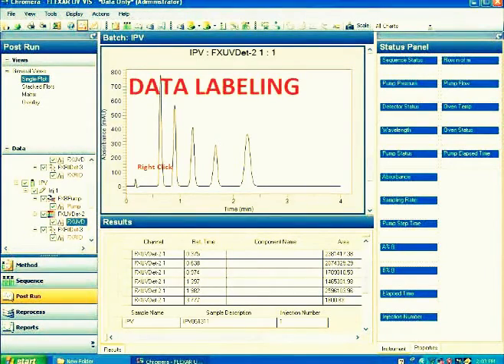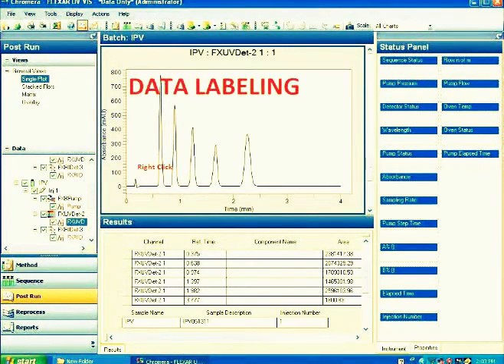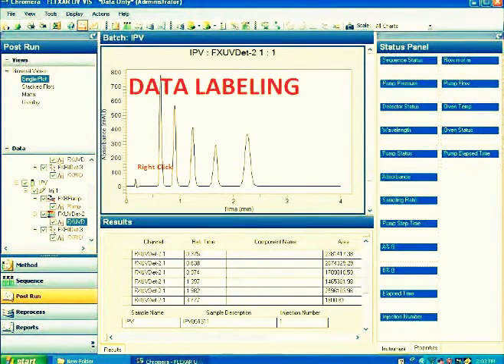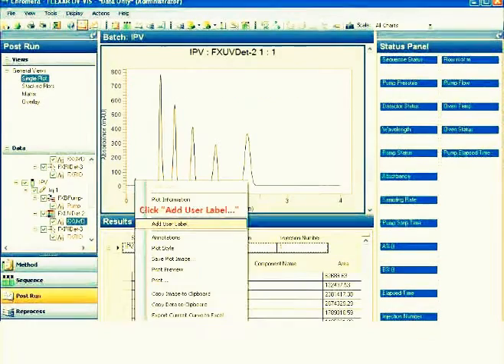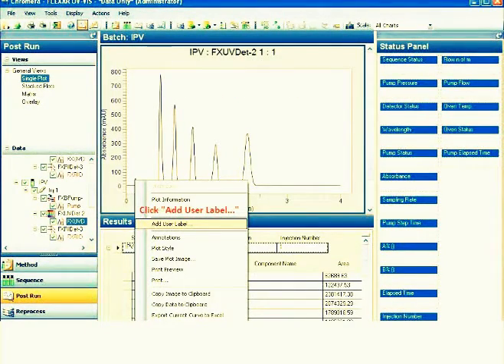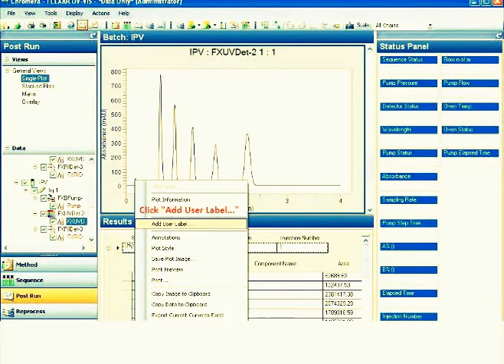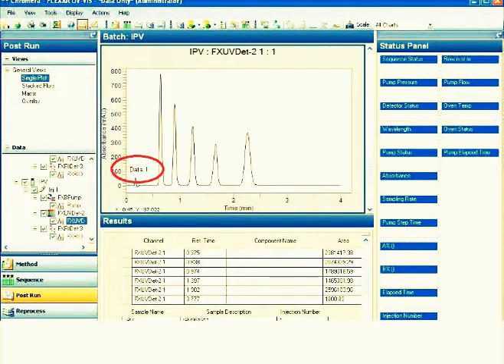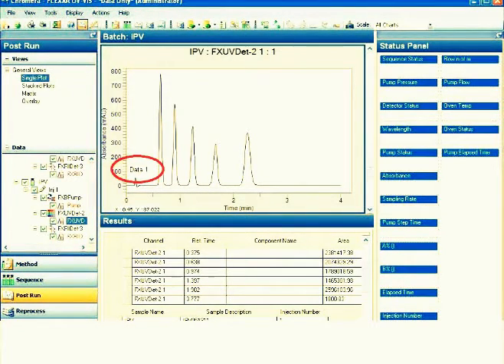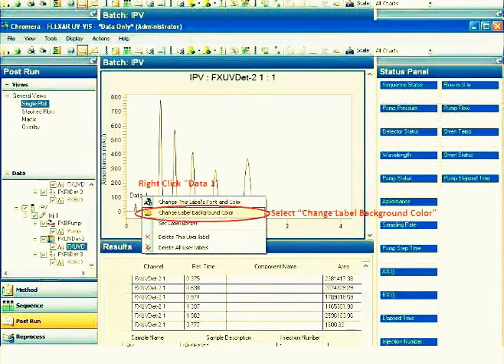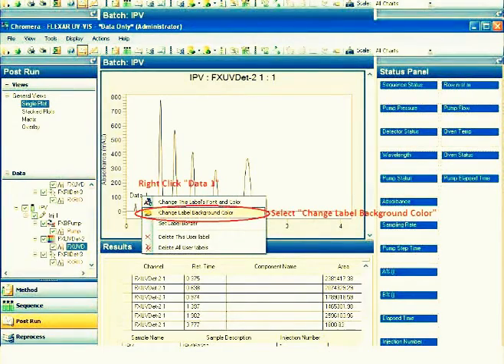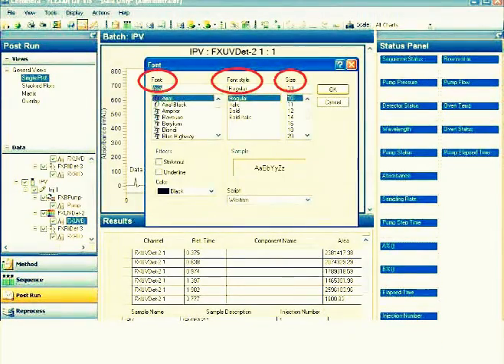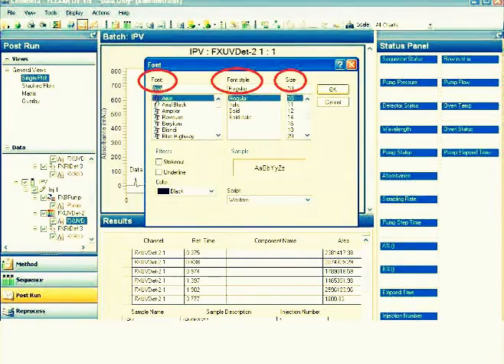This is data labeling. You just label the results of your analysis. First, right click on the picture. Then you will see Command Add User Label. Click on it. Automatically, the computer registers data one for the first peak. Then you can change the labels font color, change label background color, set label border, and you can also delete the user label or delete all user labels. You can change the font, font style, size.